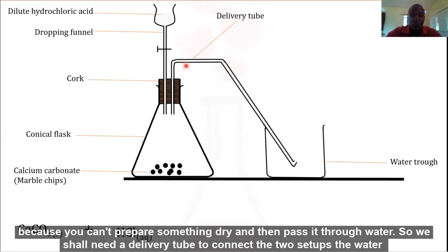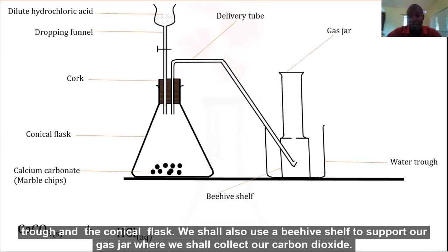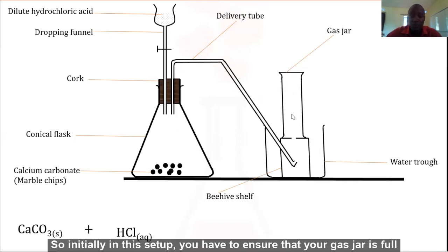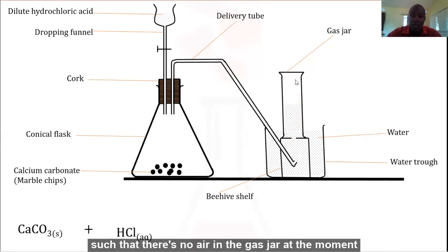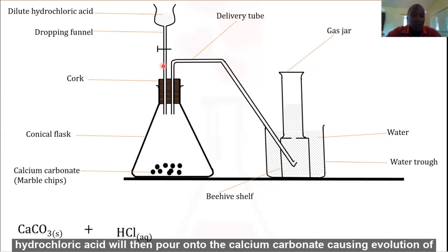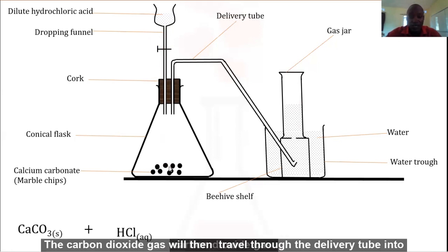We shall need a delivery tube to connect the two setups, the water trough and the conical flask. We shall also use a beehive shelf to support our gas jar where we shall collect our carbon dioxide. Initially in this setup you have to ensure that your gas jar is full of water to the brim such that there's no air in the gas jar at the moment. Not until you open this tap for the dropping funnel, the dilute hydrochloric acid will then pour onto the calcium carbonate causing evolution of carbon dioxide gas.